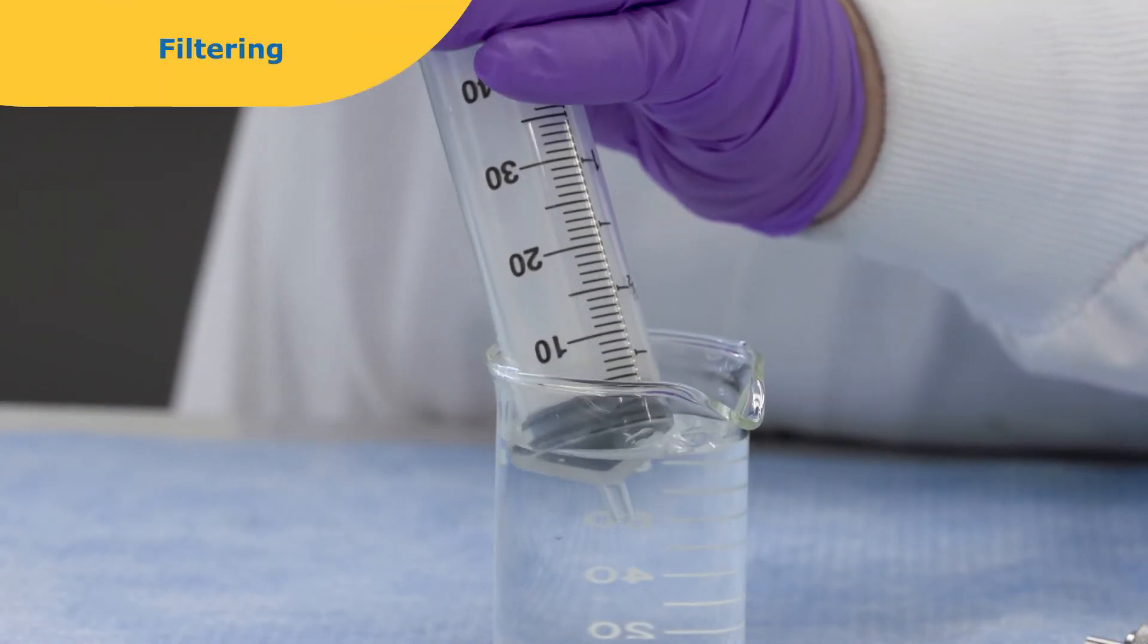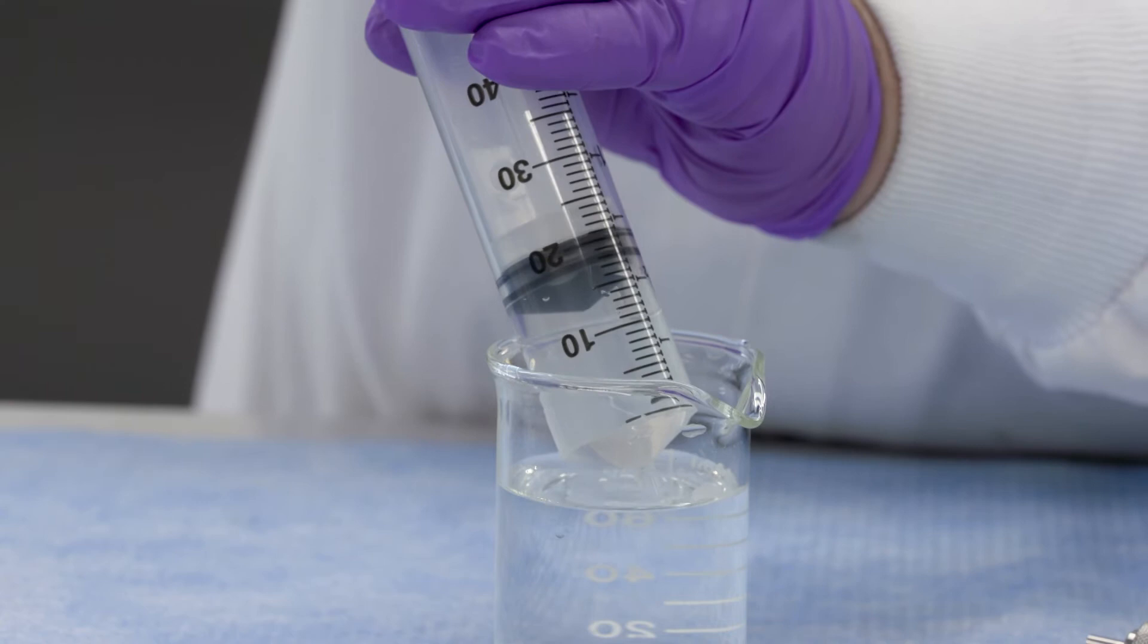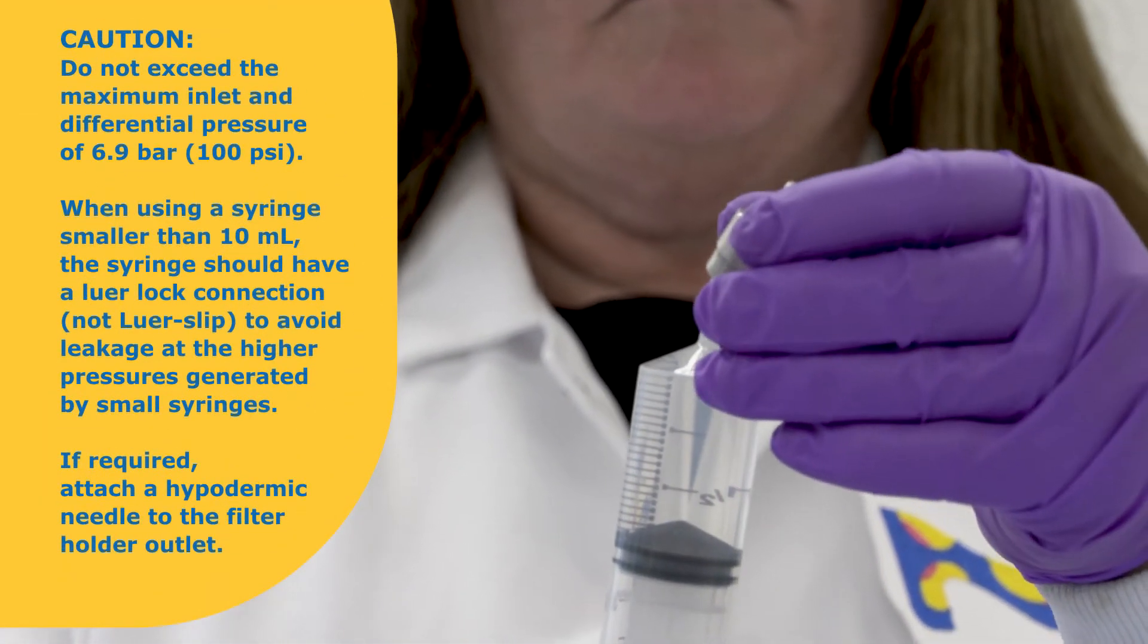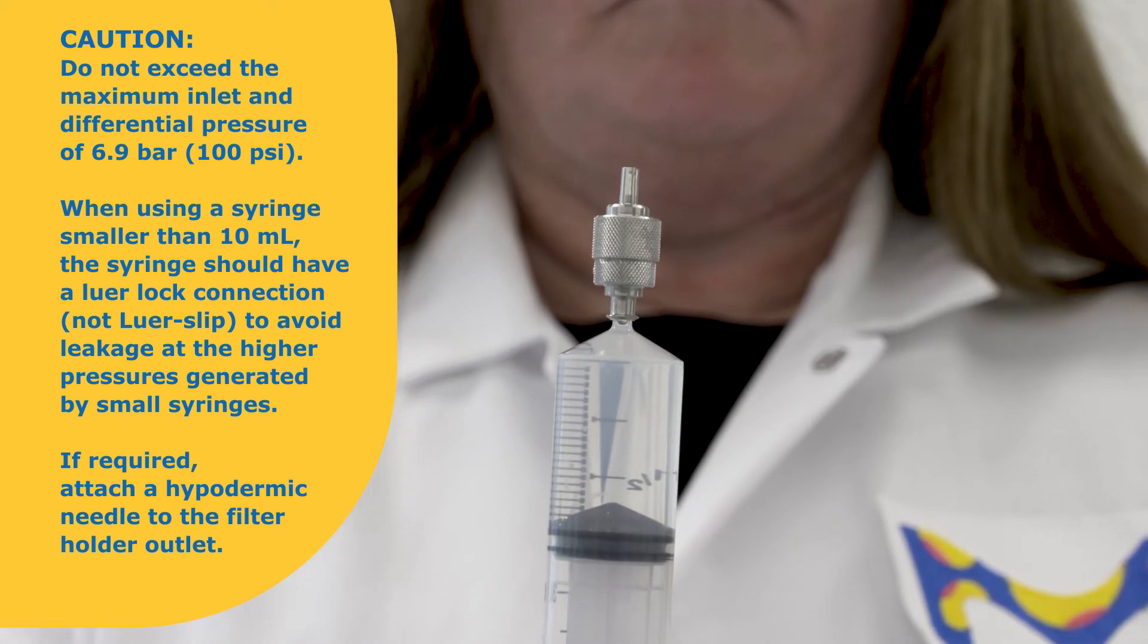To use the SWINI device to filter a sample, draw the unfiltered sample into a syringe. Attach the luer lock inlet of the filter holder to the syringe. If required, attach a hypodermic needle to the filter holder outlet for dispensing the filtered liquid.